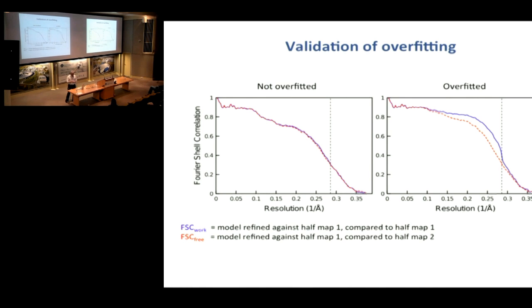Yes, at the moment I cannot give you any number that you should aim for. I can only say qualitatively that those curves should be as close as possible to each other. Obviously, the closest they can come is to coincide, but if they coincide, you may not have refined at all.